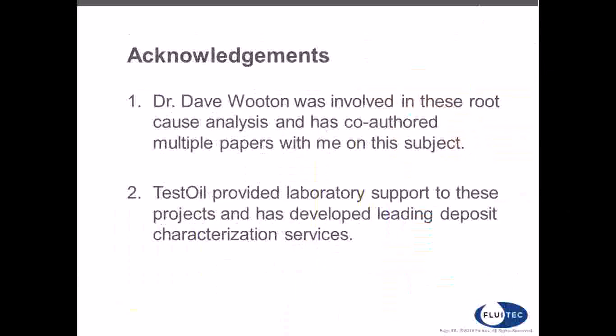There are a couple of different things that could be causing this, but in most cases, we find evidence of hydrocarbons in the deposits that have reacted with the PAG chemistry, and certainly PAGs are highly incompatible with mineral oils and other fluids, and so we have seen evidence of incompatible reactions that happen.